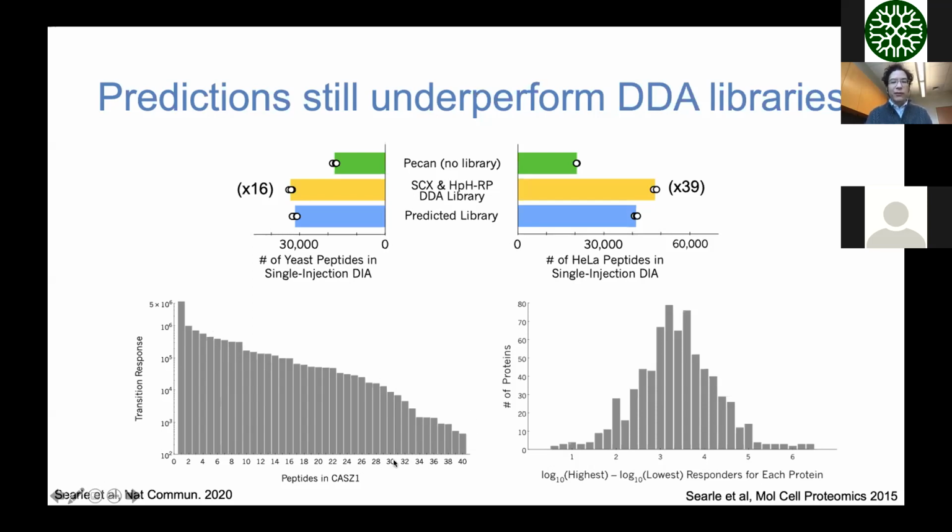And peptides 30 through 40, you're just not going to be able to see them in your experiment in most cases. And B, they're just going to distract you from being able to detect other types of peptides by confounding matters, making you look for more peptides than you need to, and making a mess of your statistics. This protein here is really common. So this was one transcription factor that we were interested in.